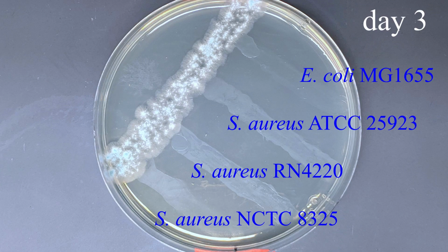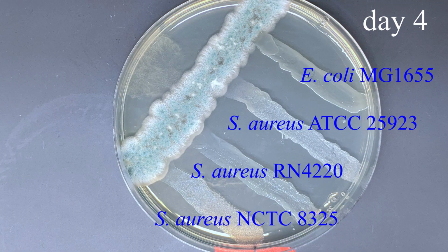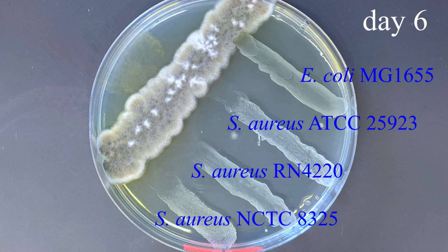After leaving the covered plate at 25 degrees Celsius for 2 more days, we see this. All 4 bacteria grow fine on the first day, possibly because P. rubens is still growing and has not produced much penicillin.